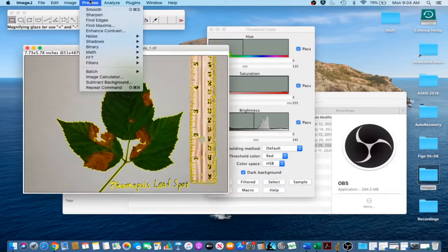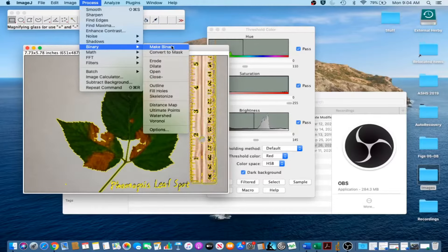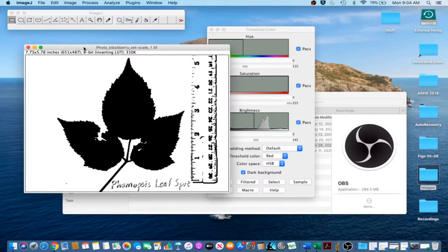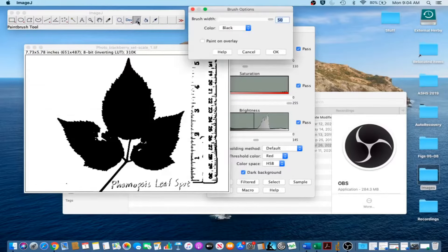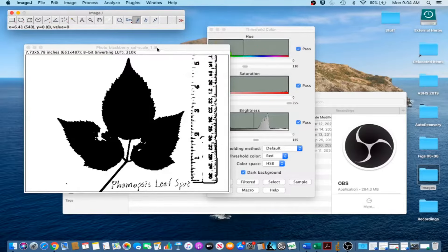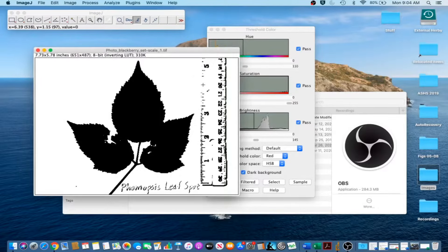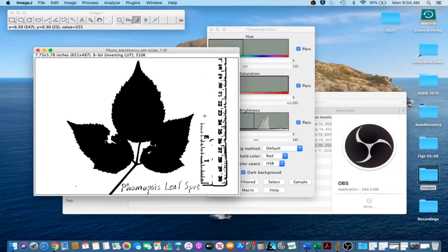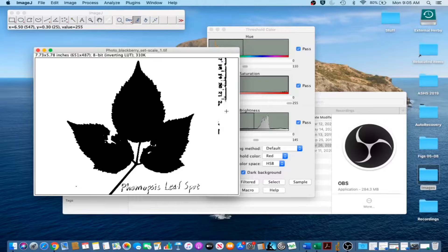Next, go to Process, Binary, Make Binary to convert the color image to a binary black and white image. We'll need to remove large clusters of pixels that are not part of the leaves. Double-click on the paintbrush tool, put 50 in for the brush width and white for the color. Make sure that the Paint on Overlay box is unchecked and click OK. Go ahead and erase the pixels that are not part of the leaf. Note that you only get one undo, so if you erase part of the leaf you have to start over.